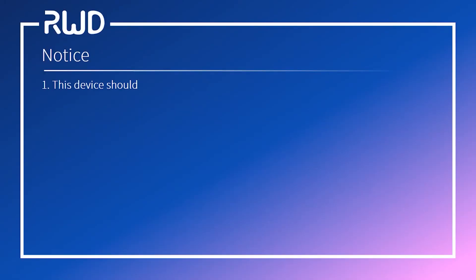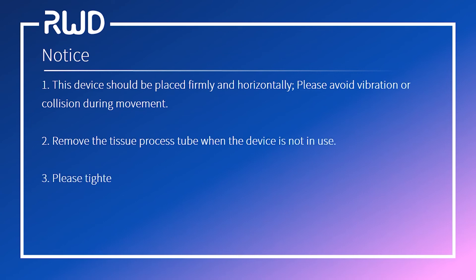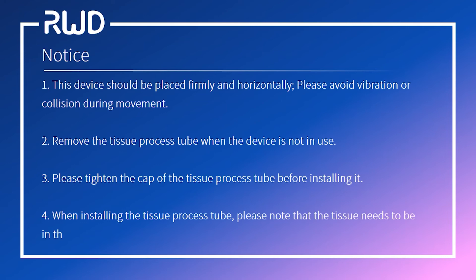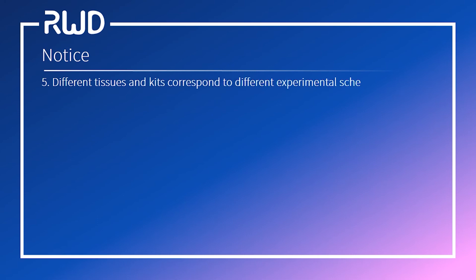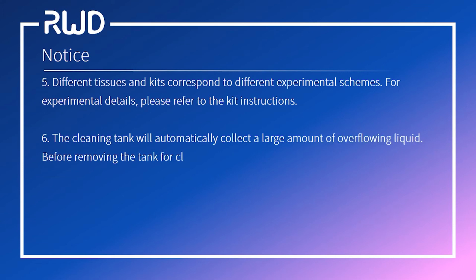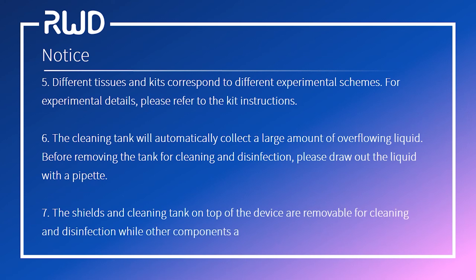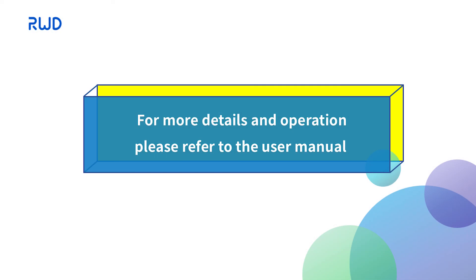Notice: This device should be placed firmly and horizontally. Avoid vibration or collision during movement. Remove the tissue process tube when the device is not in use. Tighten the cap of the tissue process tube before installing it. When installing, note that the tissue needs to be in the area where the motor is located. Different tissues and kits correspond to different experimental schemes — refer to the kit instructions. The cleaning tank automatically collects overflow liquid; draw out liquid with a pipette before removing the tank. The shields and cleaning tank are removable for cleaning, while other components are not. For more details, please refer to the user manual.